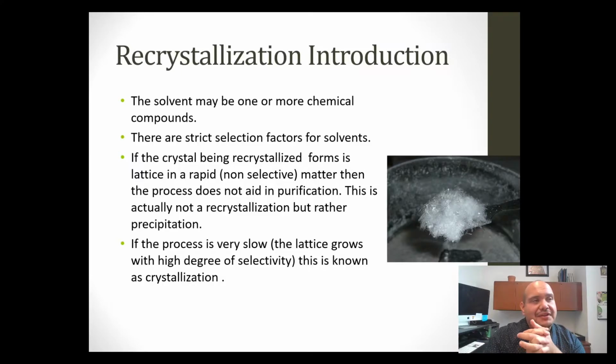And when it comes to solubility, if sulfanilamide, or just say an unknown, is added that has a little bit more polar properties as opposed to nonpolar properties, it may solubilize in one layer much better than the other layer, because the other layer is not really efficient for solubilizing perhaps, say, 75% of this crystal that's polar, whereas the rest, 25%, might solubilize in a nonpolar solvent.